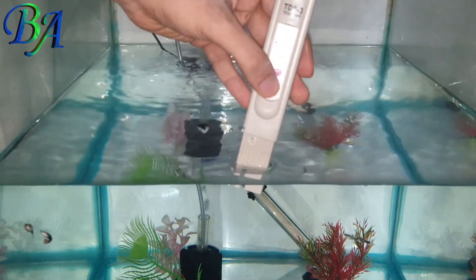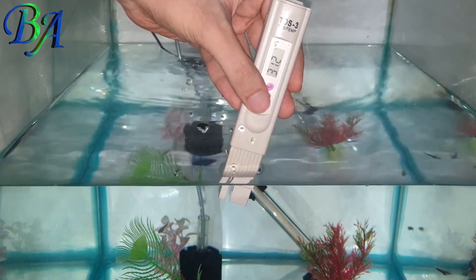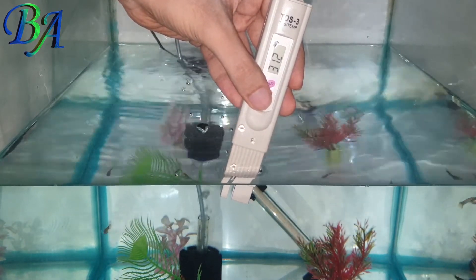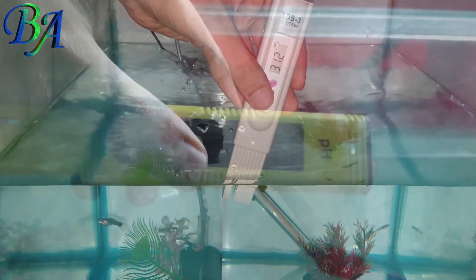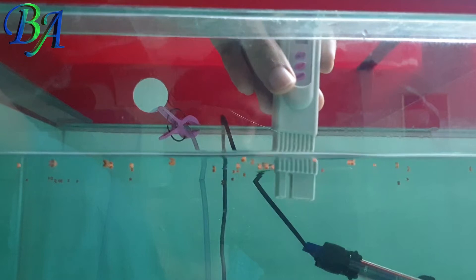Pressing the temperature button after switching the meter on will show you the temperature of the aquarium water. Now I will be checking the TDS of my discus tank in the same way.